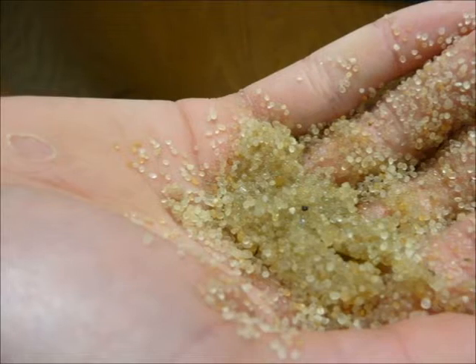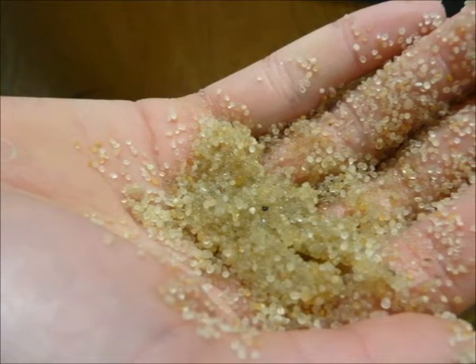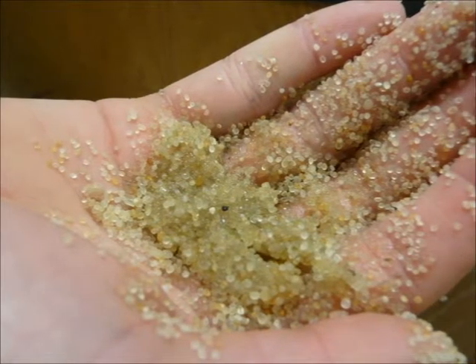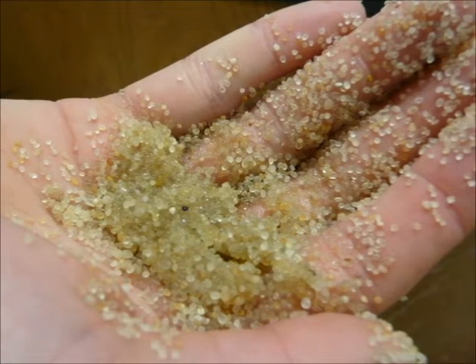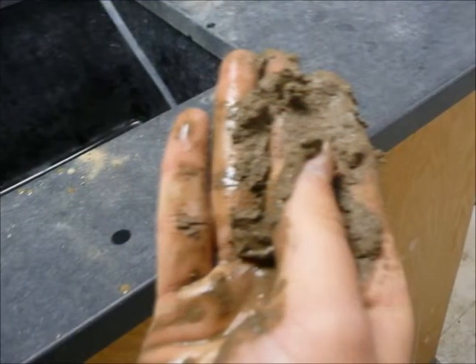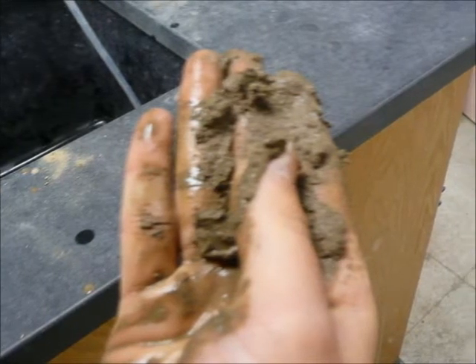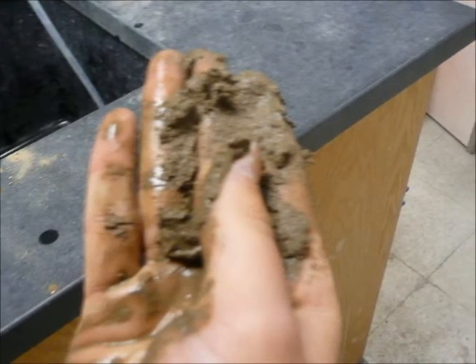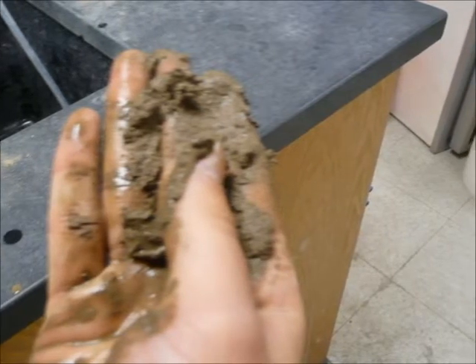Question 6: Does the soil feel gritty? Question 7: Does the soil feel smooth? Question 8: Does the soil feel neither smooth nor gritty? Question 9 can be asked during any point of the analysis: Is the soil too wet? If the soil is too wet, then add more soil until the soil becomes the consistency of moldable putty and repeat all questions.